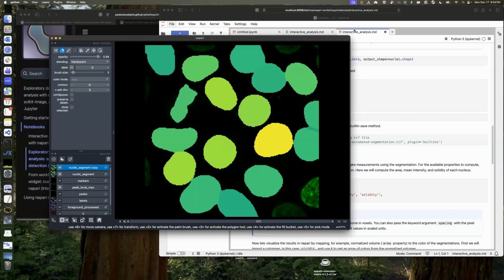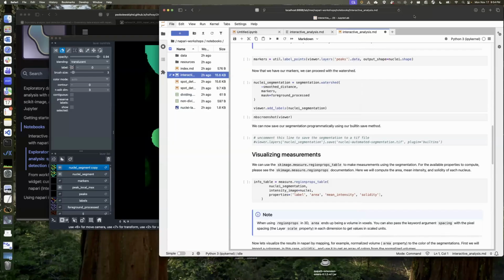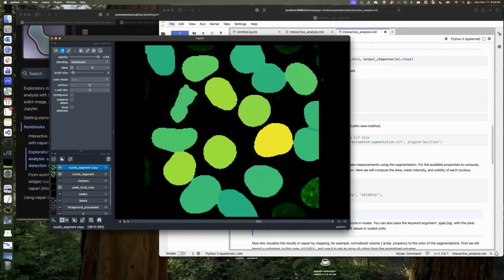Yeah, so Fiji by default has bioformats, which opens a lot of different things. In Python, bioformats is a Java library, so you can install it, but it's a little annoying to install in Python. There certainly are a lot of different libraries in Python for reading a lot of different things, but maybe not all in one place like bioformats. You certainly can install bioformats and use it from within Python, but it is a little awkward because it's Java and Python doesn't have that. Most of what I use is the TIFF file, for the things that I have. But that's a really good point.